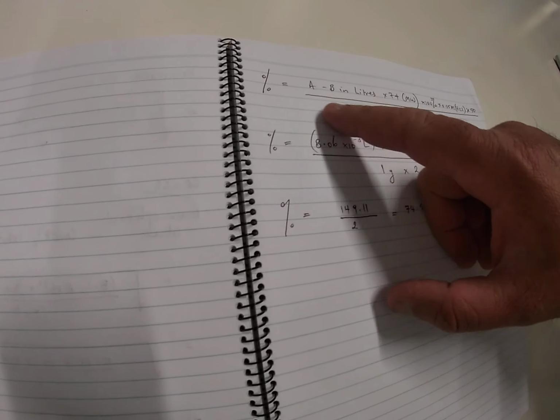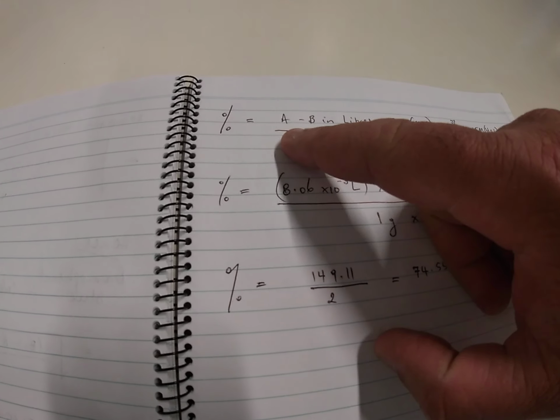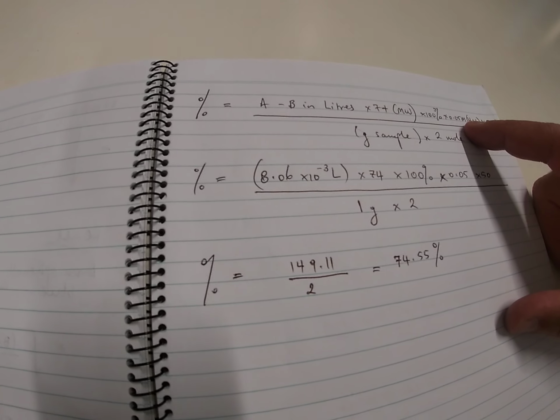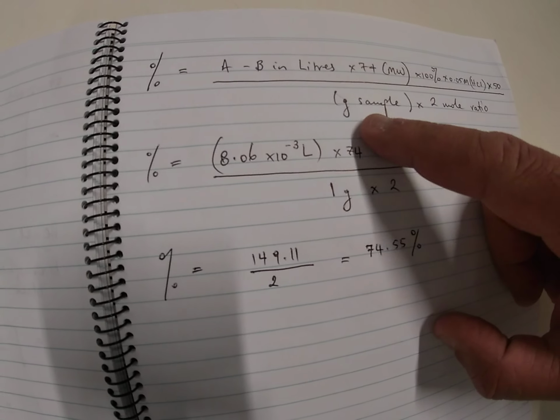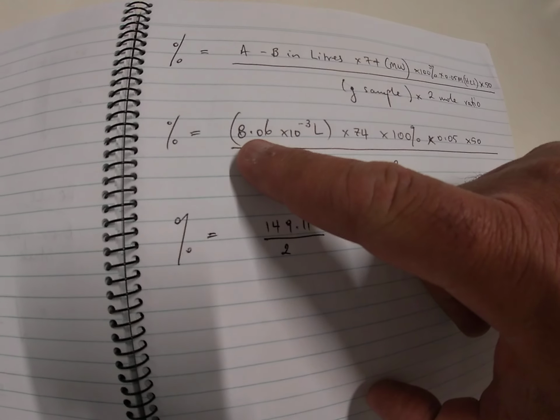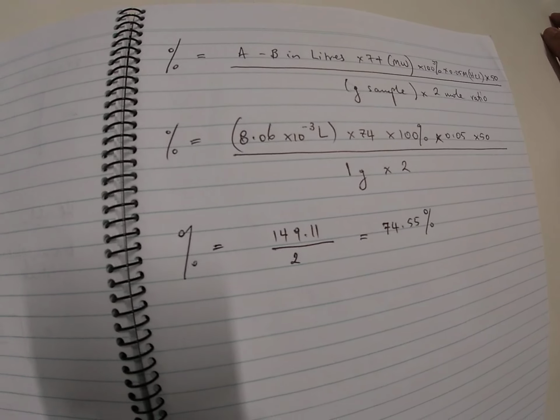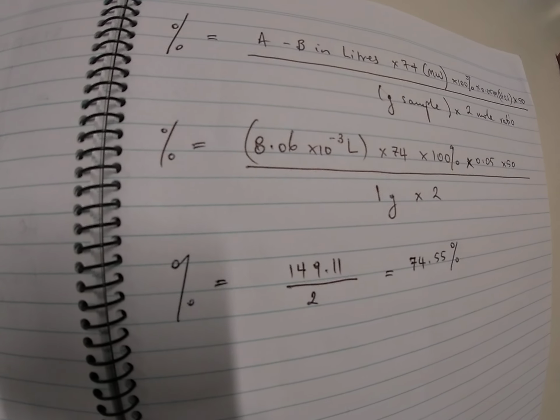So let's look at an example that Bob has done using this formula. We write the initial formula, so percentage of calcium hydroxide is equal to A minus B in litres times 74, which is molecular weight, times 100%, times 0.05 molar, which is the concentration of hydrochloric acid, times 50. And then divided by the grams of sample times the 2 mole ratio. So it's 8.06 times 10 to the minus 3 litres, because we're just using calcium hydroxide in solution number 1, and we're just using the mean for this example.